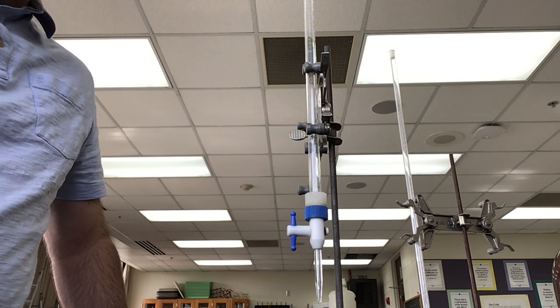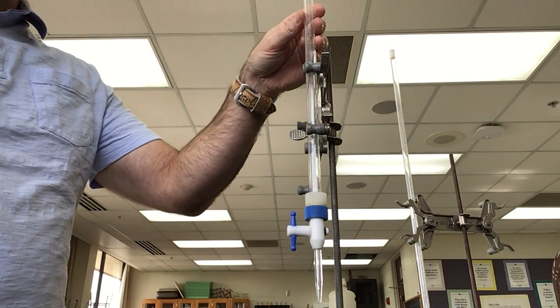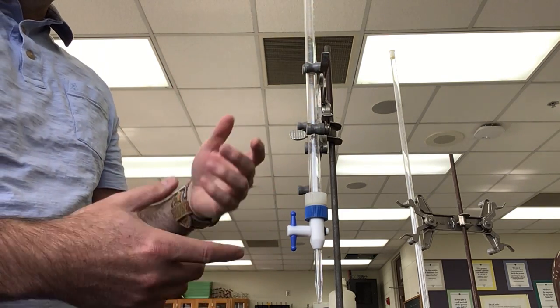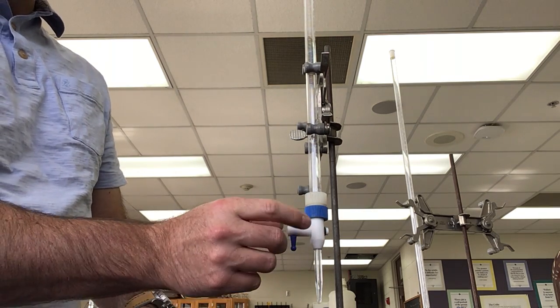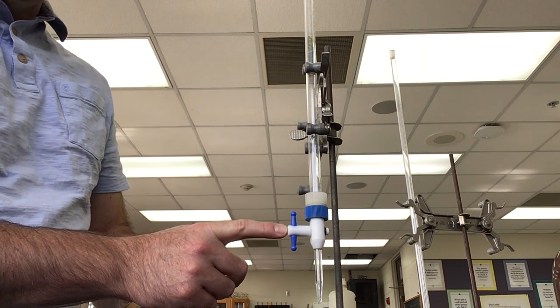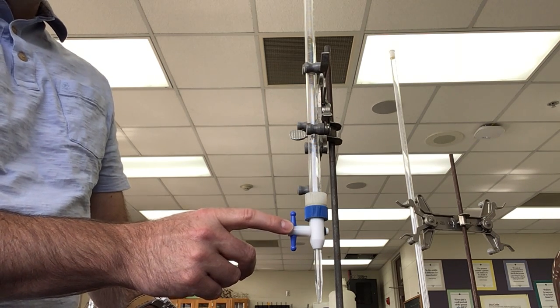What I want to do is go through how to prep your Buret for a titration. All right. So first of all, this is your Buret. When you get it, it should be all kind of together, but they actually come in two separate pieces. There's the glass tube itself here, and then there's the tip, which also has this valve on here called a stopcock. I usually call this just the valve, just because sometimes people giggle.